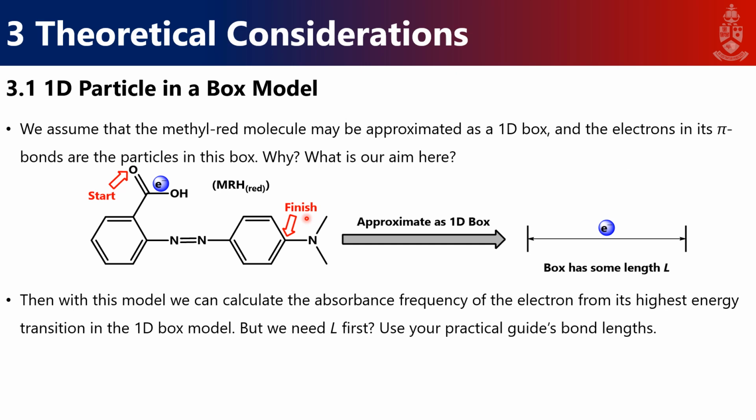Okay, so that was the experimental side of the experiment. Now, let's say, for example, we did not know our methyl red is going to absorb at 520 nanometers and our deprotonated version is going to absorb at 425 nanometers. How would you have gone about determining what those wavelengths of absorption were? One way is, of course, to look it up in literature, but another way, using quantum mechanics, is that we can calculate what that absorption frequency should be.